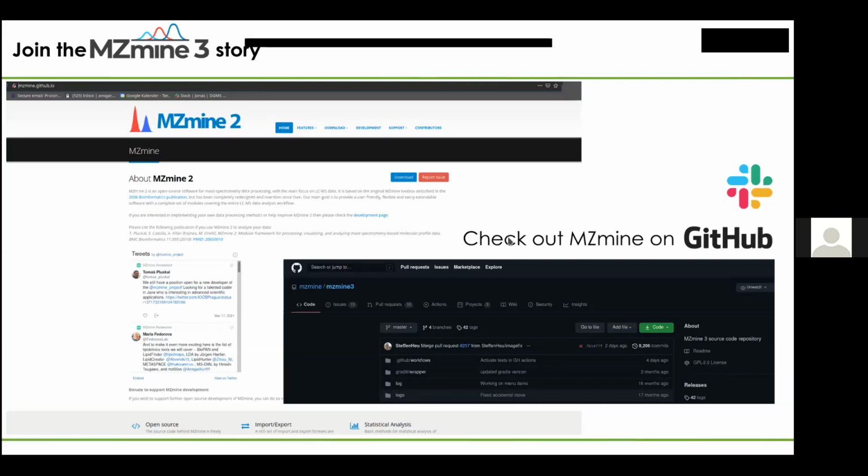But if you are more interested in checking out the code, I highly recommend the GitHub space. You can also check the code base for MZmine 3 there already. And if you're really interested in contributing to the project, I highly recommend contacting me or Tomasz or anyone from the project, and we can invite you to the MZmine Slack, where we discuss future developments of the project.